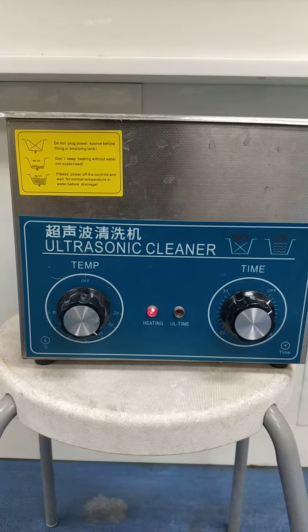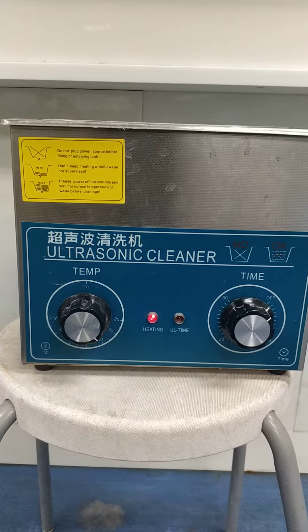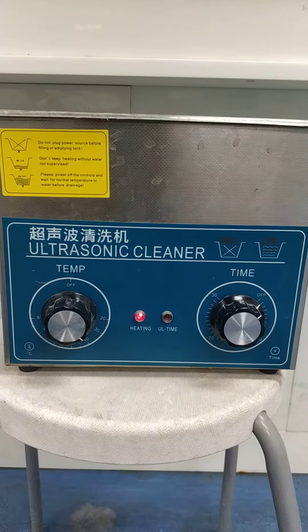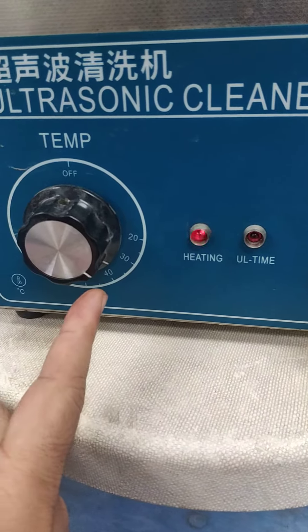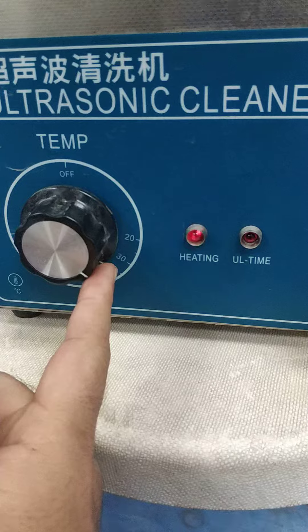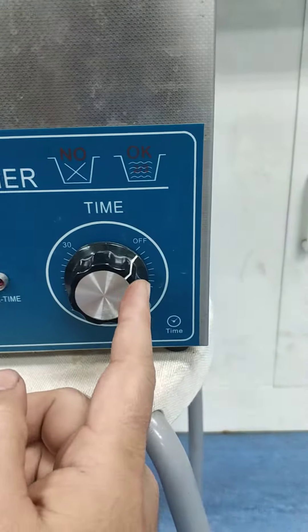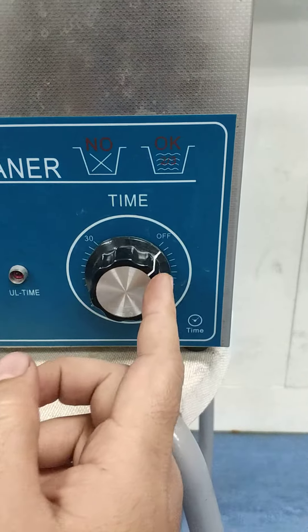Hi, this is the ultrasonic cleaner for rock samples. I want to explain the procedure. The temperature should be at 35 — if you see it's 35 — and you should use three minutes.